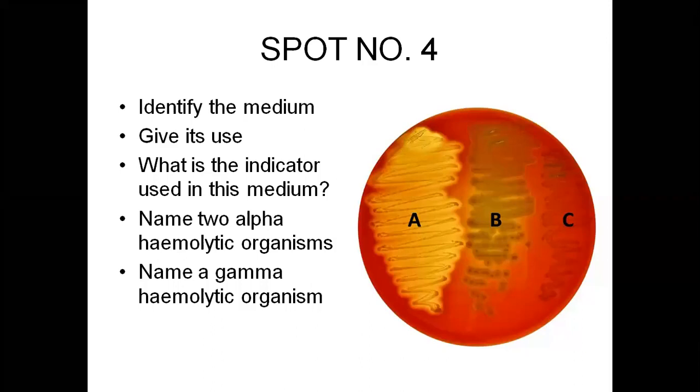This is a common thing that we speak and we ask, but this is actually not a proper question. I have written it intentionally because the question should be: name non-hemolytic organisms on blood agar. So the hemolysis or hemolytic organisms can only be alpha or beta hemolytic.